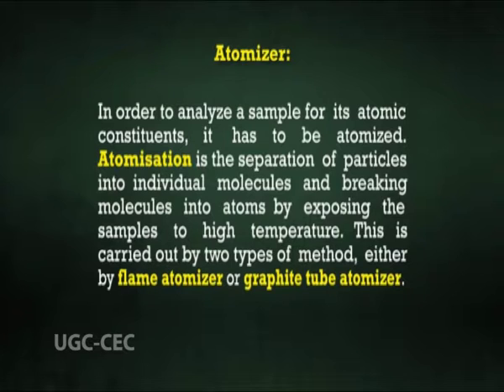Atomization is the separation of particles into individual molecules and breaking the molecules into atoms by exposing the samples to high temperature. This is carried out by two types of method, either by flame atomizer or graphite tube atomizer.